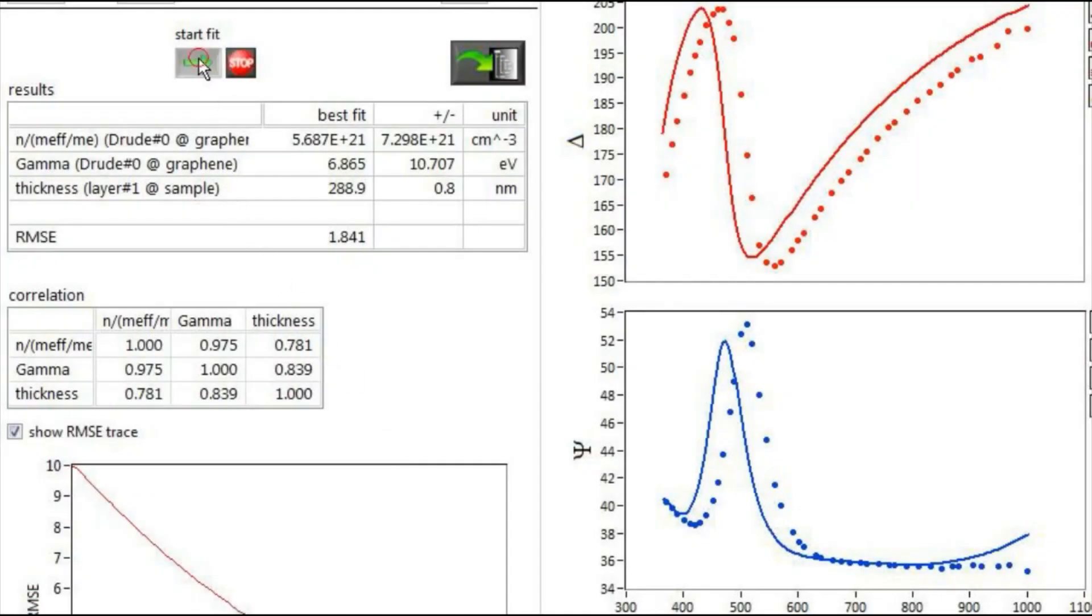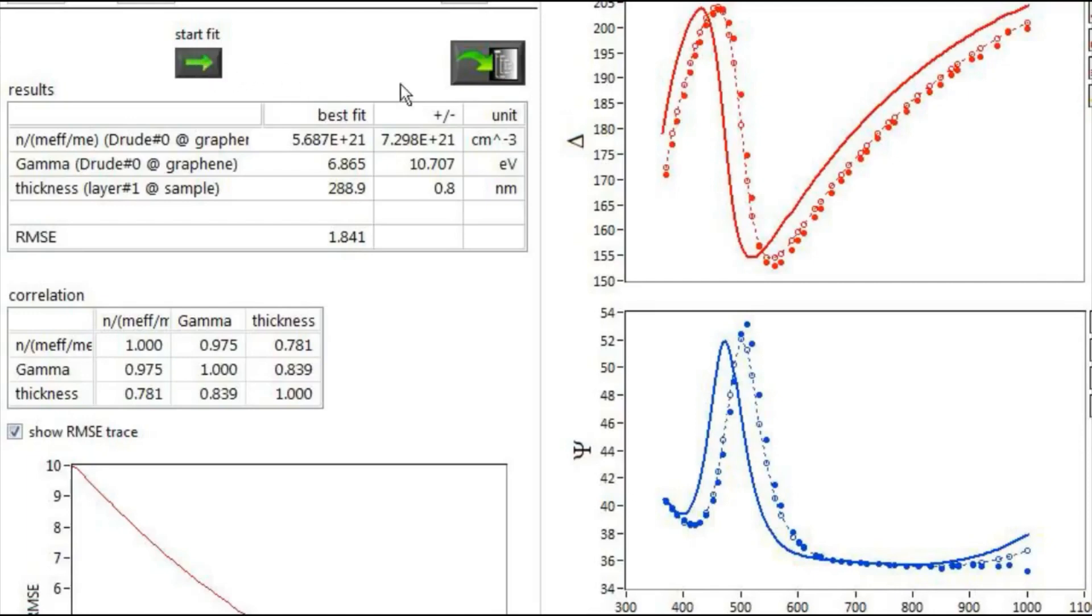After selecting the fit parameters, for example, the thickness of a layer, you may start the fit process.